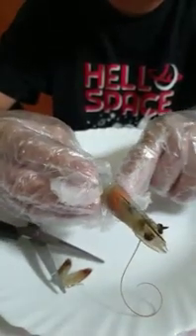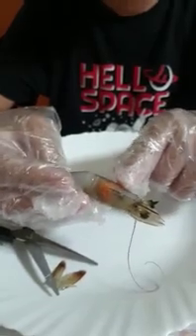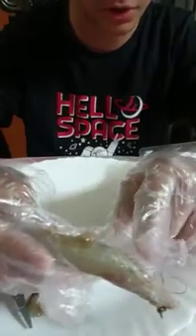And they have this brain, as you can see. If we take out this, the red part is their stomach. They have their stomach right here, their brain, and their nerves. Their nerves are right here, as you can see. They're like green veins. That's the nerve.